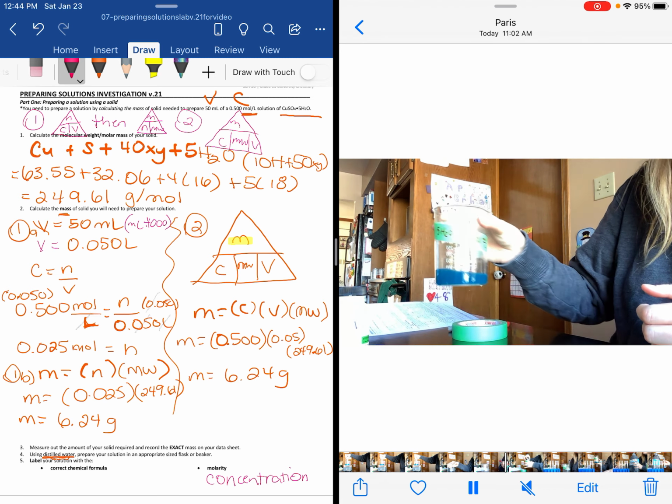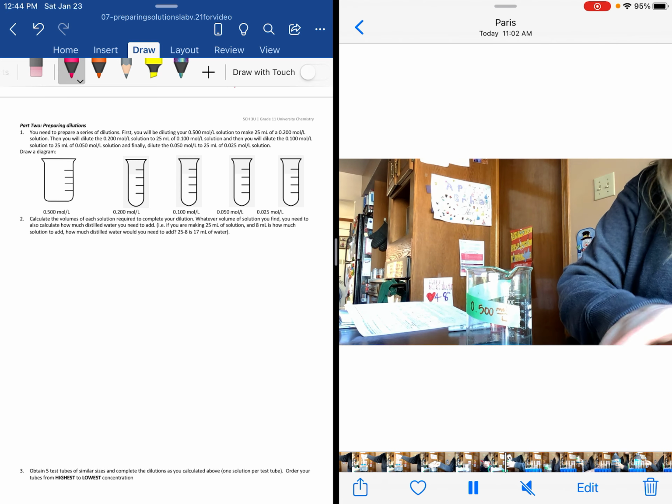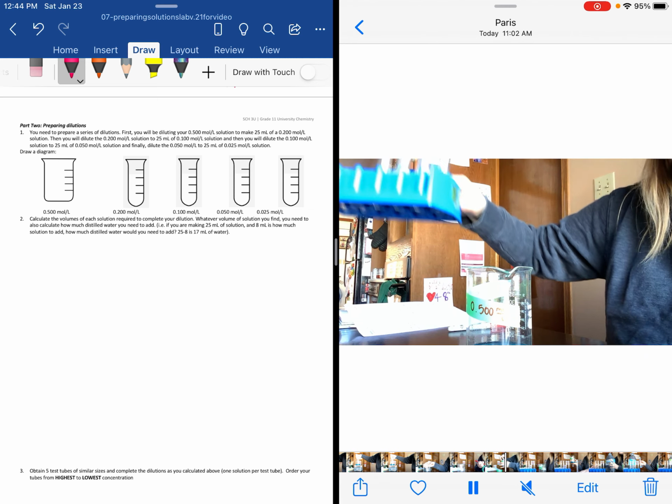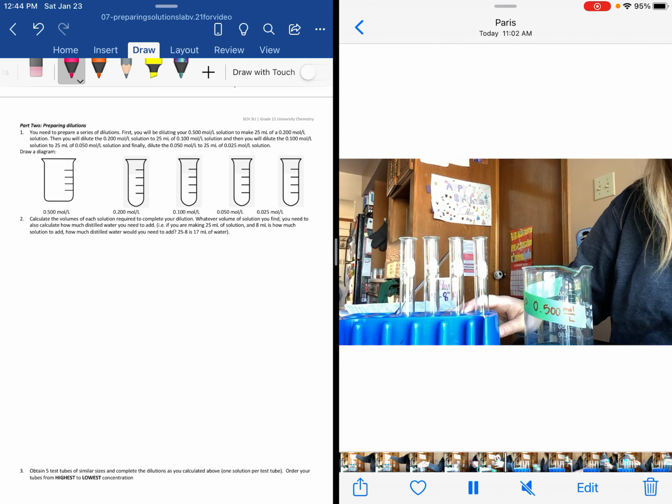Okay. So now part 2 is making this solution more dilute, okay? So again, if you haven't watched the dilution video yet, go back and make sure you do that.